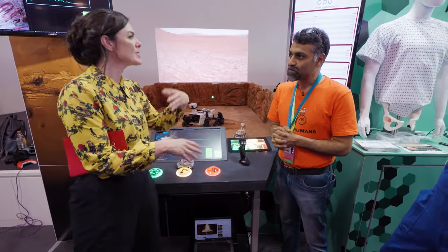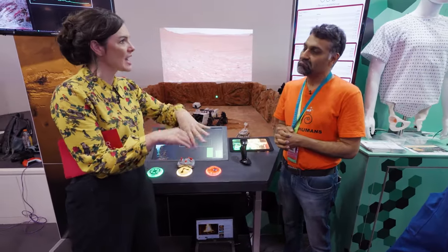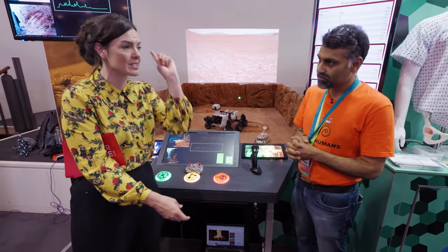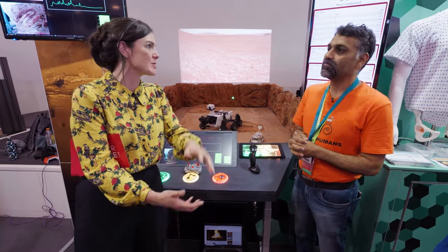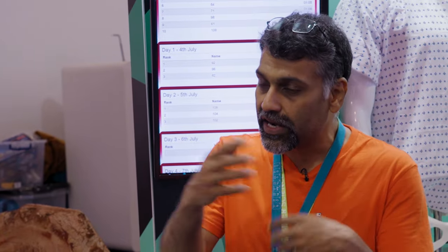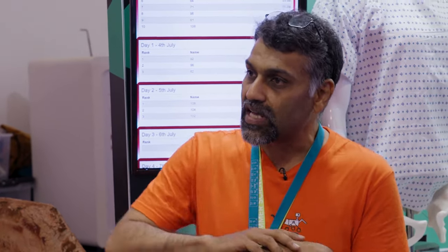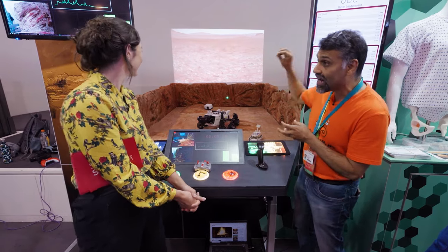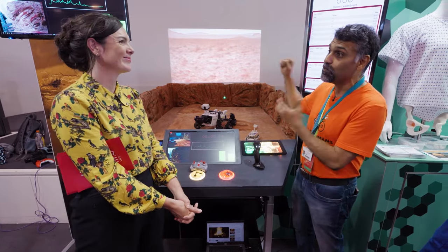Brilliant. And this is new technology, isn't it, with the laser and then looking at different chemicals and going, okay, that one's made of this, this one's made of B, C, D, and E, and this one's made of that. That's correct. And NASA recognized this technology. It's actually an old technology, but reinvented because of advancements in lasers, advancements in detection, and so on. NASA recognized the importance of it, and that's why they have it on their rover, currently looking for signs of life on planet Mars.